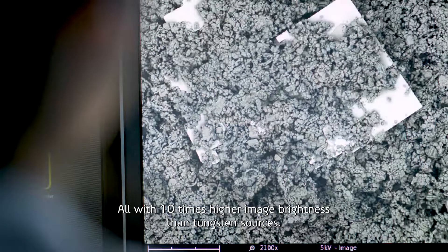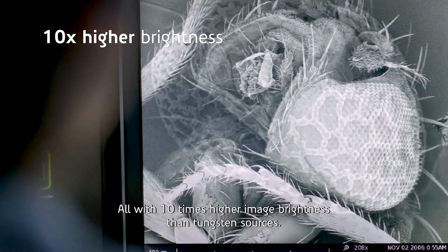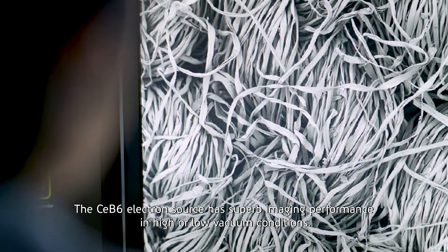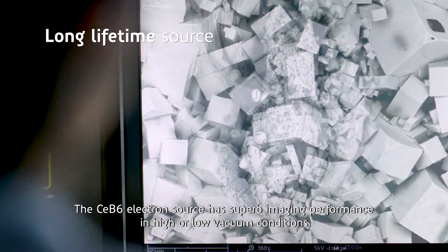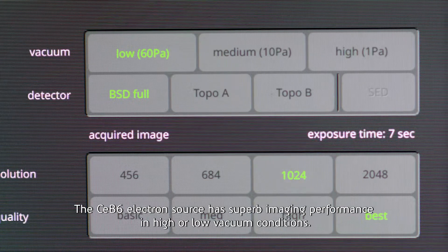All with ten times higher image brightness than tungsten sources. The CE B6 electron source has superb imaging performance in high or low vacuum conditions.